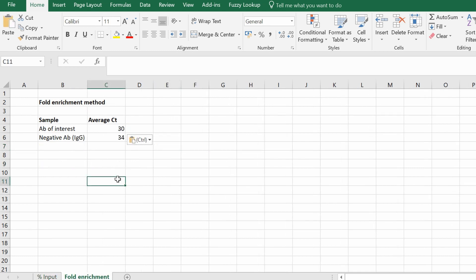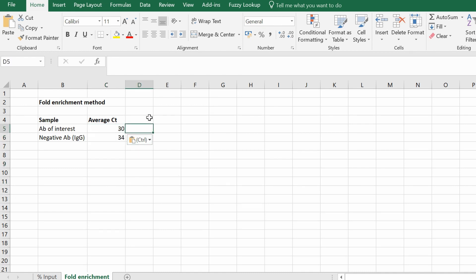The other method commonly used in ChIP qPCR data analysis is the fold enrichment method. For this you generally just need two samples: one using the antibody of interest, and another which is the negative antibody, IgG antibody, or no antibody, for example. Again, these are just the CT values for the technical replicates displayed here.